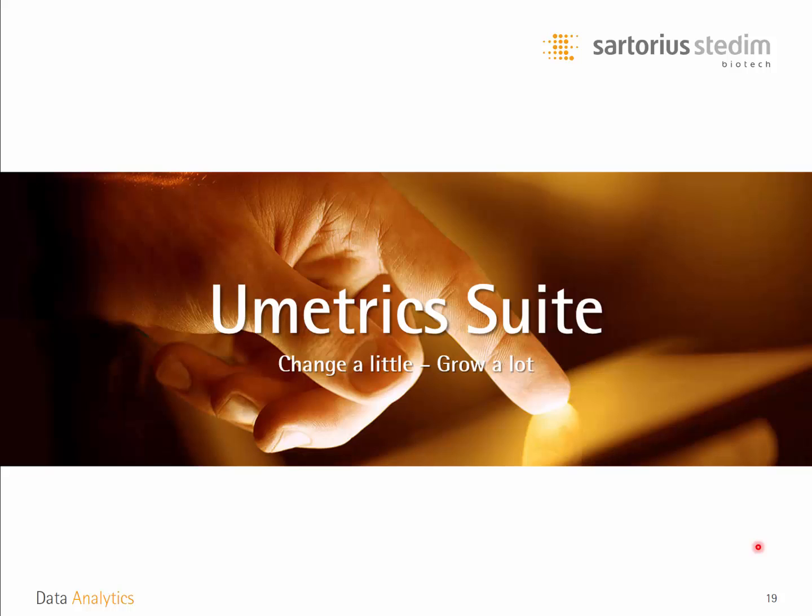This brings me up to the last slide, and I would like to emphasize that with the Umetrics Suite, you can analyze your historical data, you can find the golden nuggets, but you can also plan future measurement campaigns in order to make them maximally informative. So the whole ambition and the whole goal of the Umetrics Suite is to help our clients and users by capitalizing on their data. As I said, finding the golden nuggets, understand how to modify things, change a little, and thereby grow a lot.